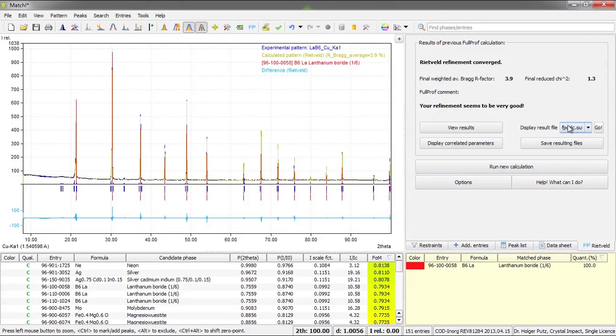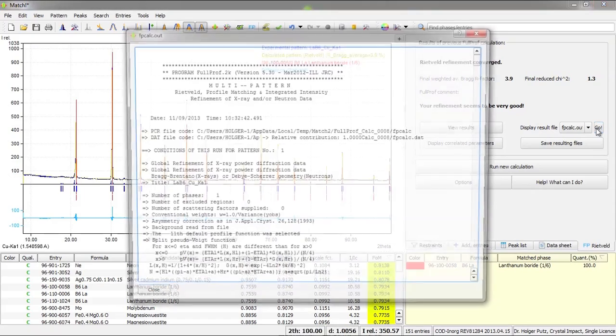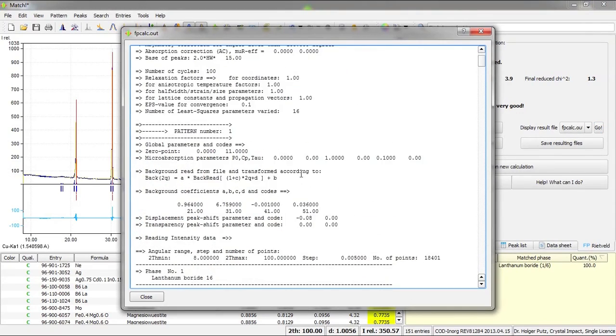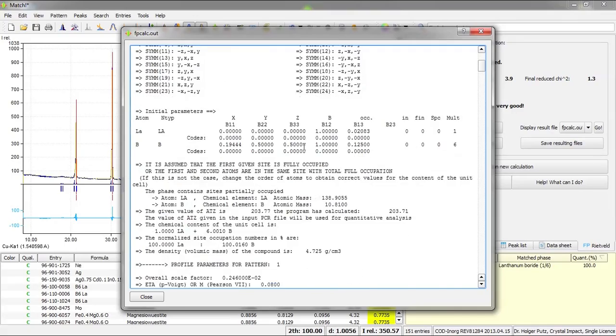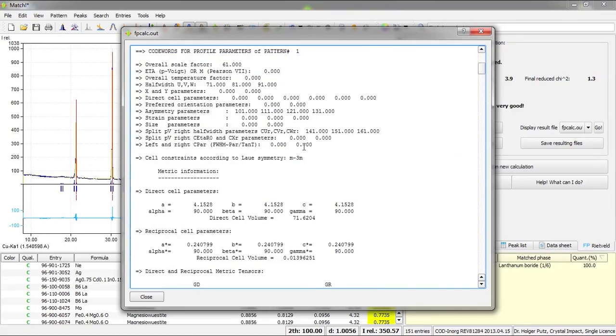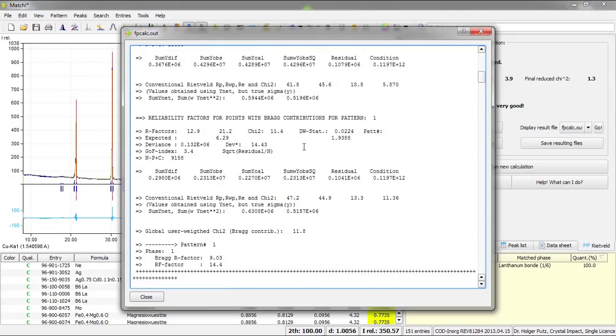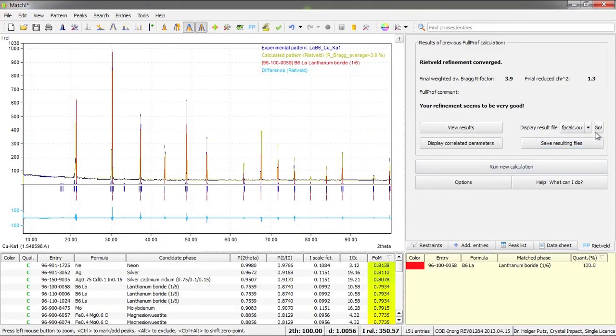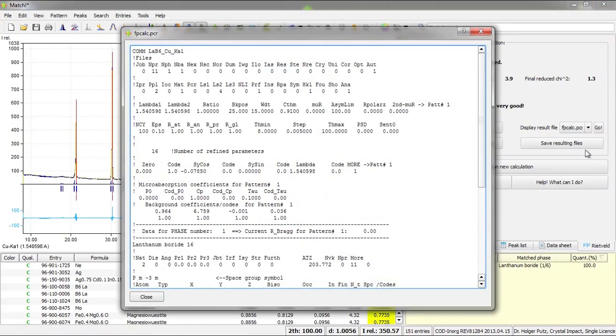In addition you have access to the original full prof files that are used or produced during the calculation. For example here is the output file from the full prof calculation. You can go more into detail if you would like to do so. There are other files available, for example the PCR file that is used to control the calculation.